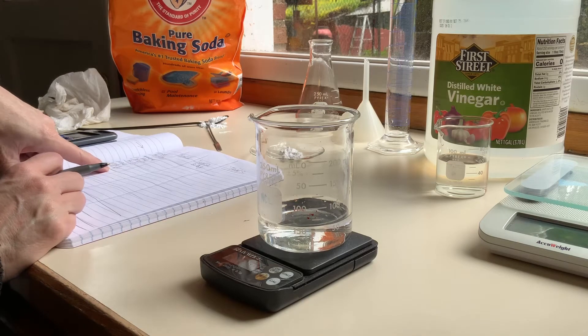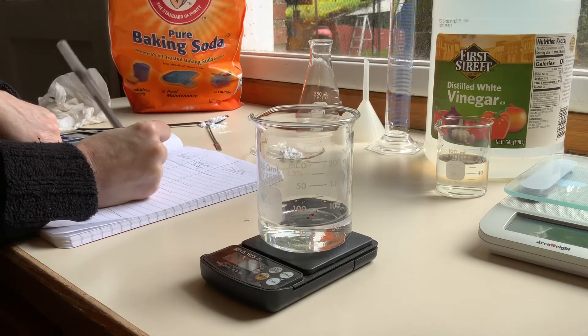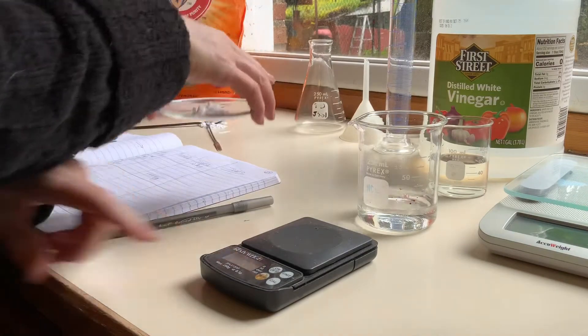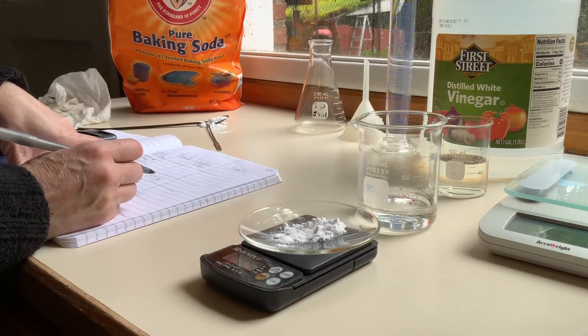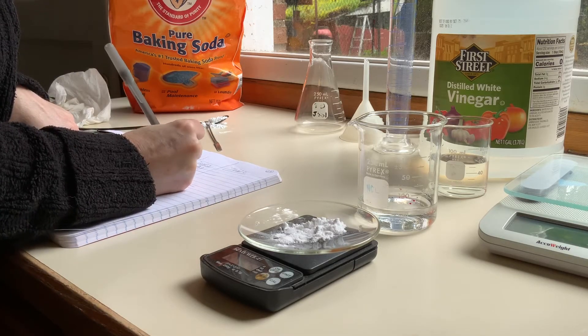I'm going to weigh my beaker with the acid. The mass of the beaker with acid before the reaction is 159.9 grams. Then I'm going to weigh the watch glass with the baking soda on it, and that is 57.9 grams.